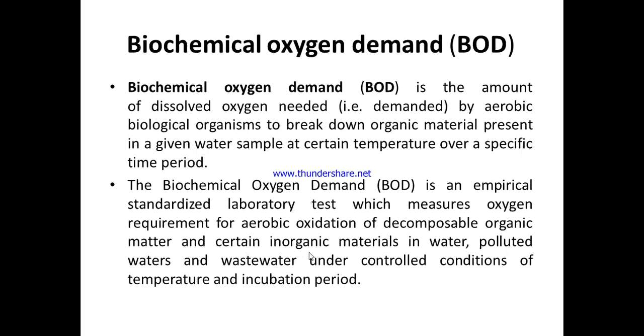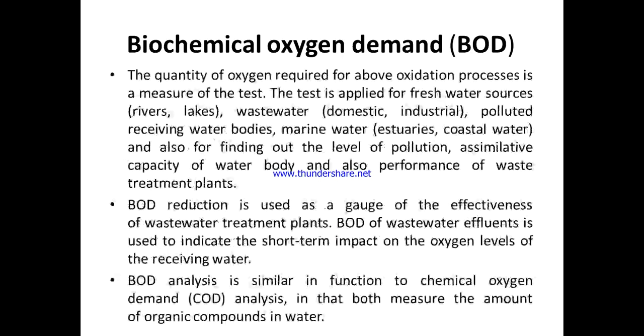Okay, so the biochemical oxygen demand is an empirical standardized laboratory test which measures oxygen requirement for aerobic oxidation of decomposable organic matter and certain inorganic materials in water, polluted waters and wastewater under controlled conditions of temperature and incubation period. You know, BOD is calculated at 20 degree centigrade incubation for 5 days, right.